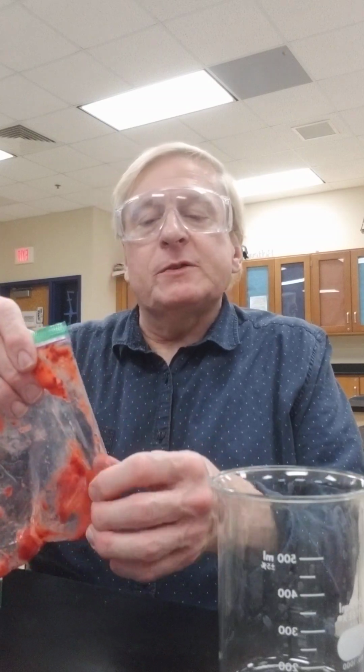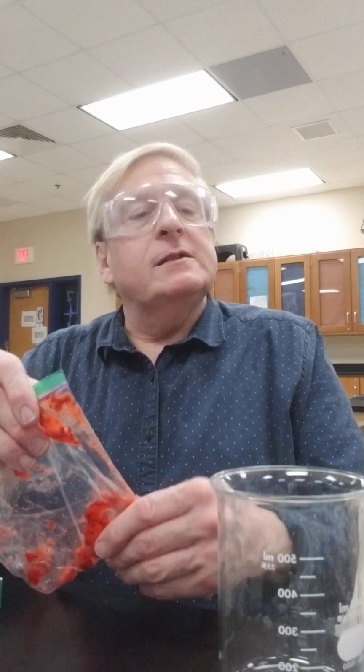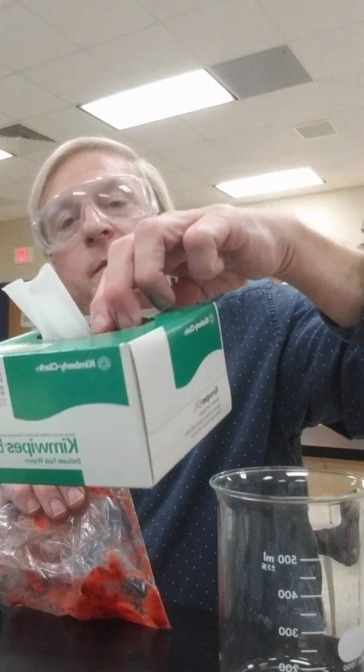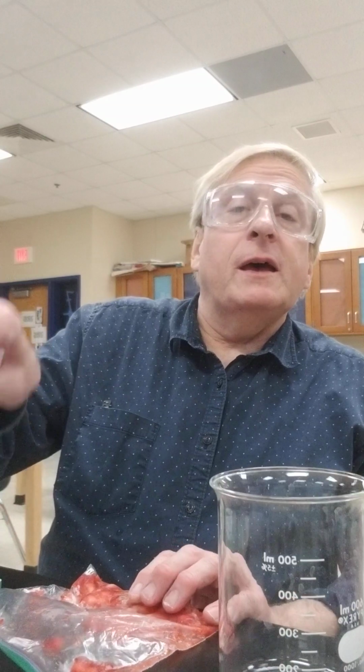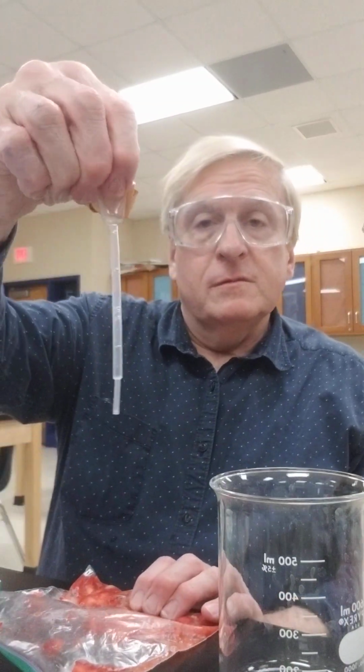You probably want some paper towel on hand too. I have some trusty Kim wipes since I'm in a lab. When it comes to pulling the DNA out of the final liquid, I'm going to use a pipette. You can use a coffee stirrer if you need to, if you're at home.